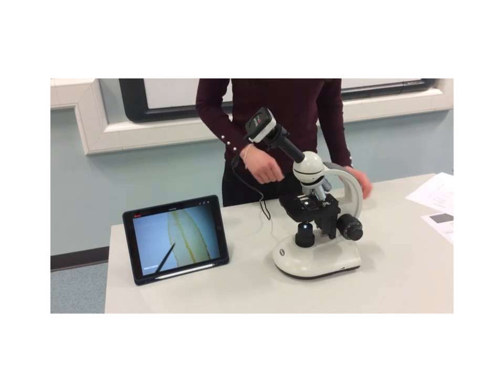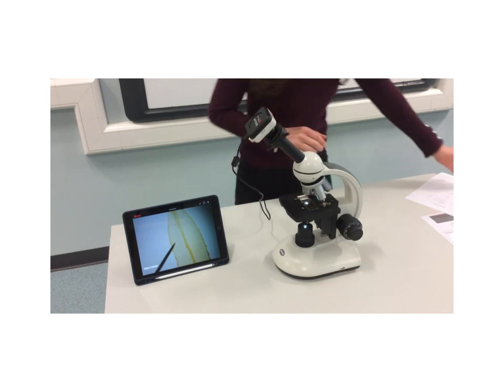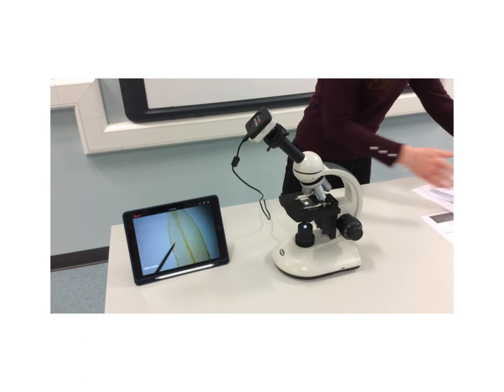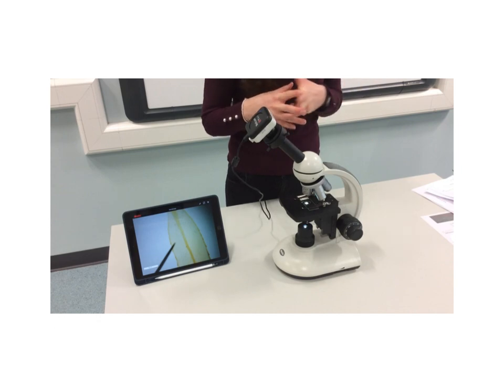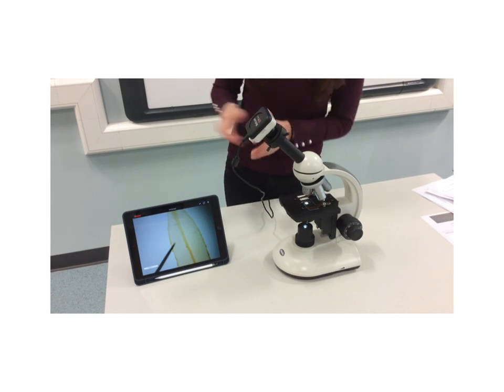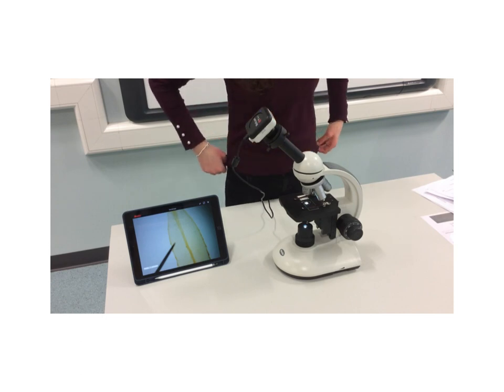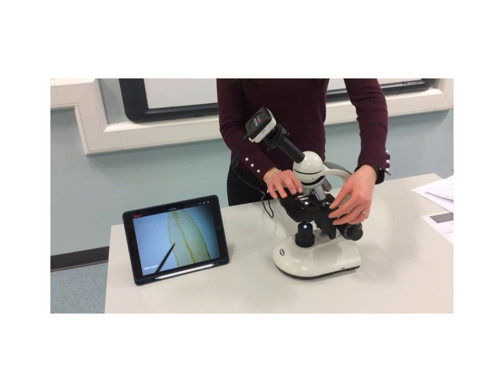But what I want to do is have a look at your notes and see what happens when I move this slide around. Make sure you're at page 3 of your booklet. It says there in question 1, using the low power objective lens to move the slide in the directions given, write down your observations. So I want you to have a look at the iPad and see what happens when we move it in the different directions.